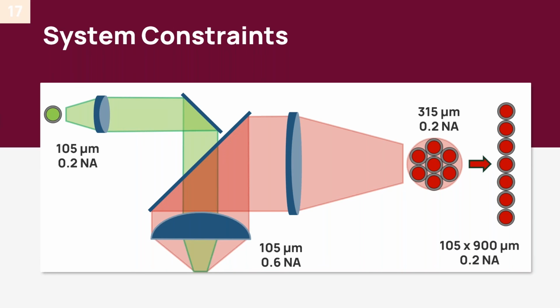So typically what we would do is you could use a lens that has 3 times the focal length, crop that down from a 0.6 NA to a 0.2 NA, and then put it on a fiber 3 times the size geometrically. So what we would recommend, or what would be a good solution here, trading an NA for geometrical aperture instead, put it on a fiber bundle with 7 fibers in it, typical standard 0.2 NA, and take that round fiber bundle into a linear one, so the coupling with the spectrometer becomes really, really good.